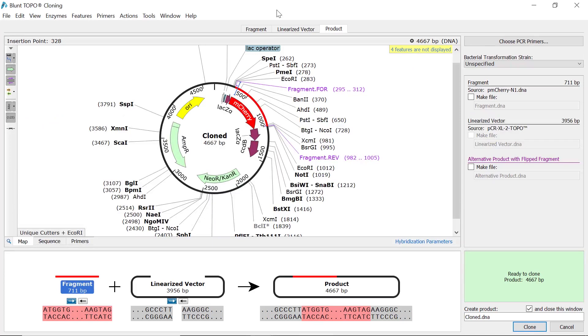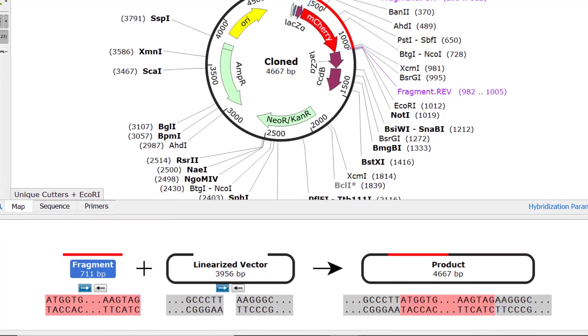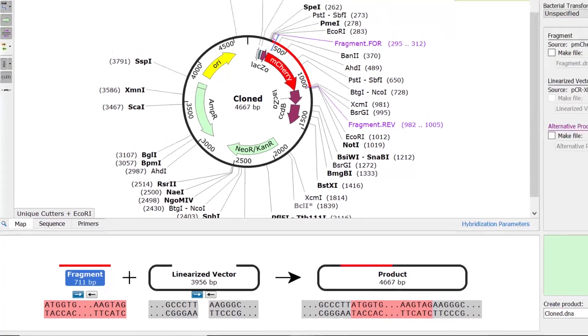Finally, let's look at the output for blunt topo cloning. As the name suggests, you will see a blunt end fragment fused with a blunt end linearized vector.